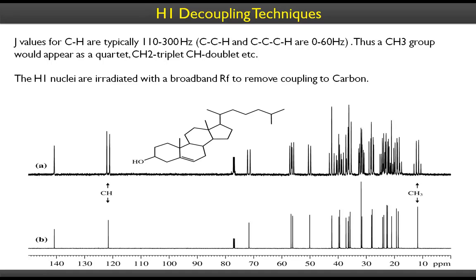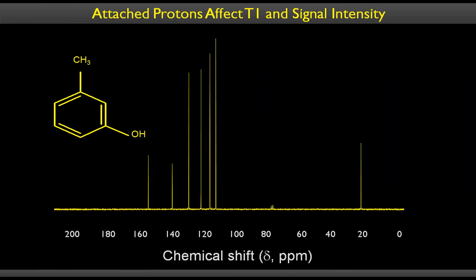That information can be derived from edited NMRs, edited C13 NMR. We call it edited because we can still obtain the information that we are losing by going to the decoupled fashion. We'll talk about the edited NMRs in a while. That is called the attached proton test. The attached protons information has been taken off by turning the decoupler on, but how would we gain it back if we want it?